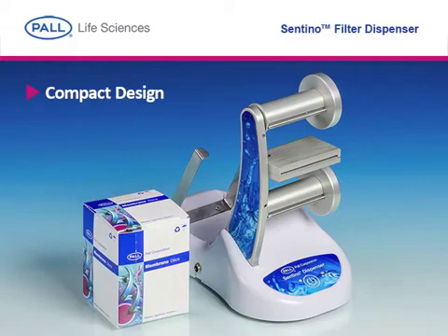The Sentino filter dispenser is the smallest automatic dispenser on the market with a compact refill pack to minimize waste, providing a greener option for busy laboratories.